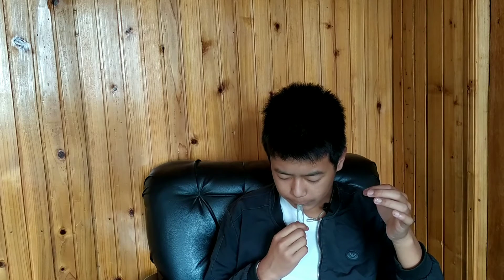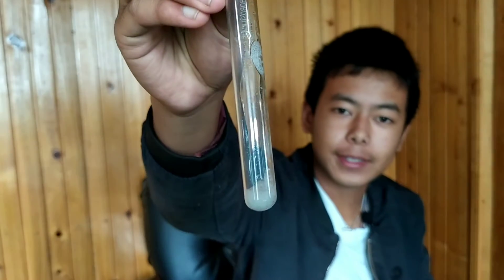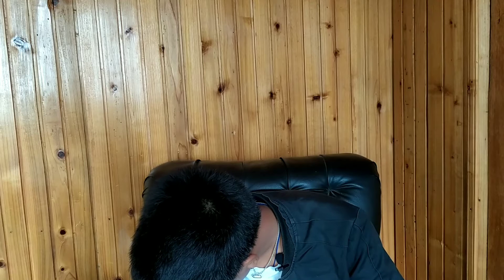To carry out this procedure, you're going to need a test tube or any kind of small container so you can fill it up with your saliva - but not too much, only a little amount of saliva is needed just to place it on a microscope slide. With the help of a pipette, I'm going to take a small amount of it and place it on a microscope slide.